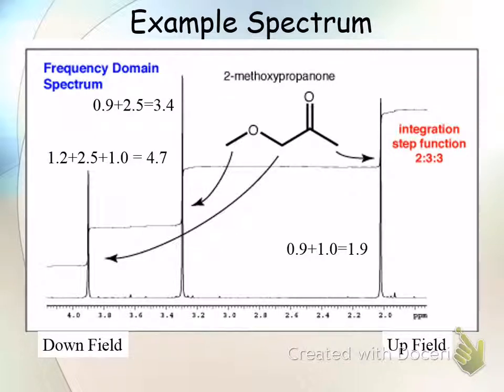Okay. Is there any real reason the methyl next to the ester is higher than the methyl next to the carbonyl? Methyl, it's not an ester, but because it's further away. Ether. Yeah. So this one here is further because the offset for being attached directly to the oxygen is 2.5. Is that what you're asking?